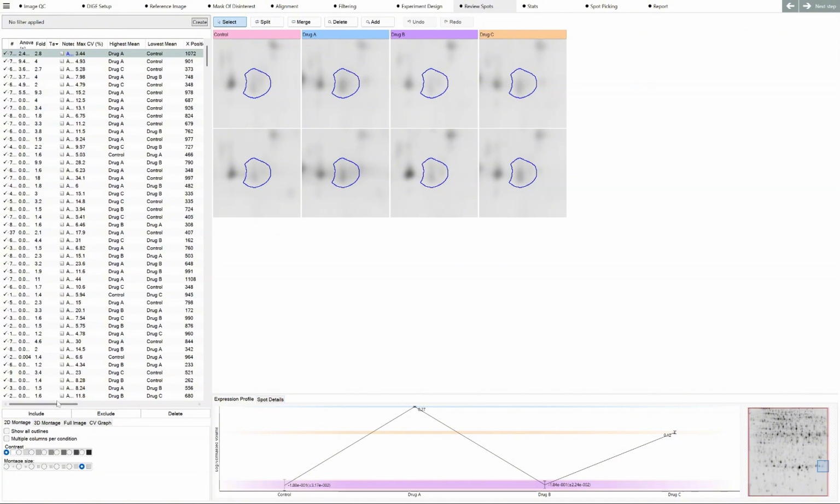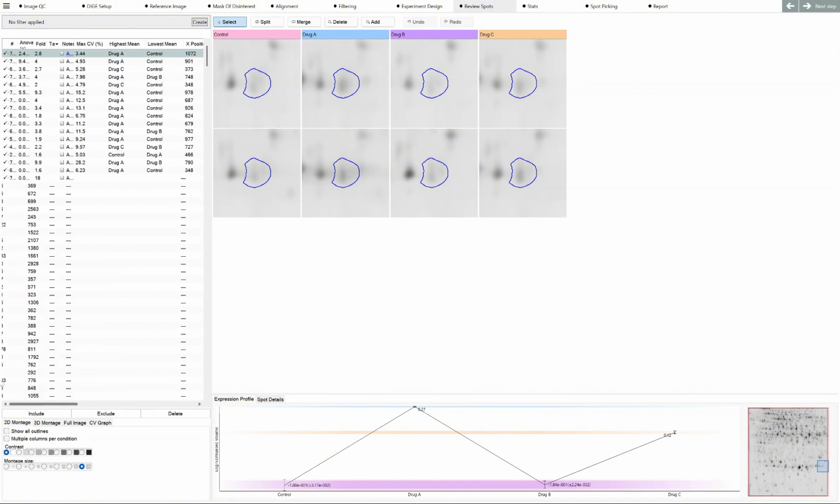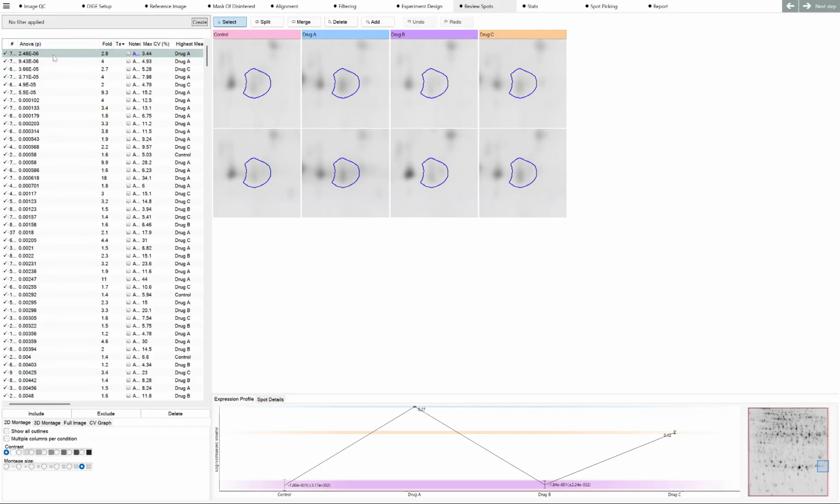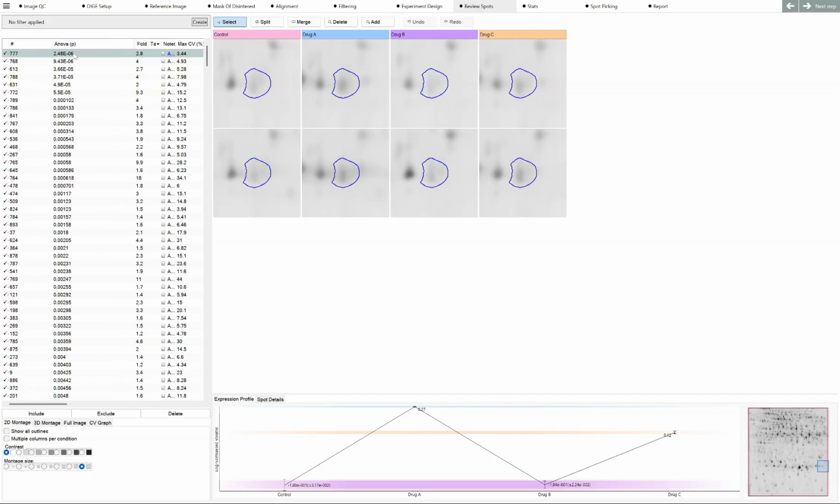I don't know if it's significant or not. Probably is. Yes, there's a 2.8-fold change, and it's given me a p-value of what? Very much below 0.05. I can't read scientific notation these days, but it's 0.000002, well within statistically significant bounds.